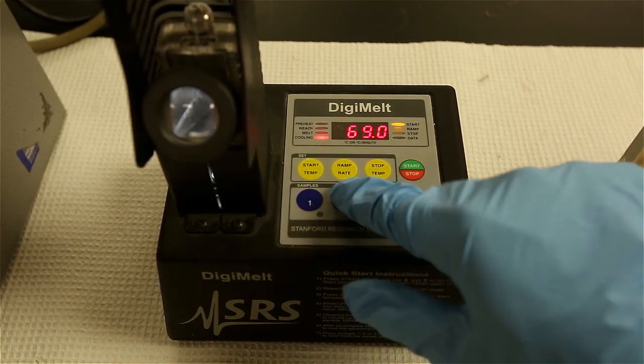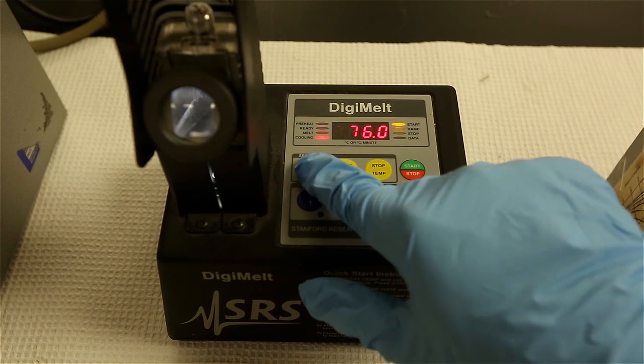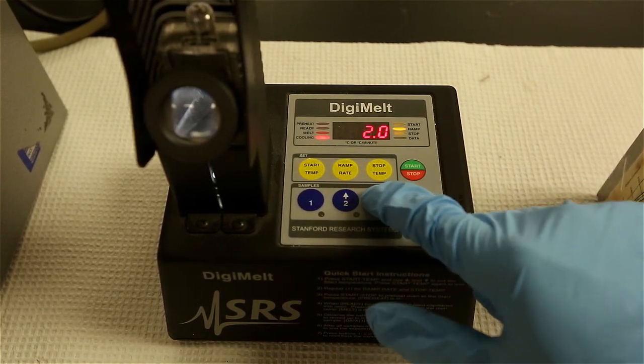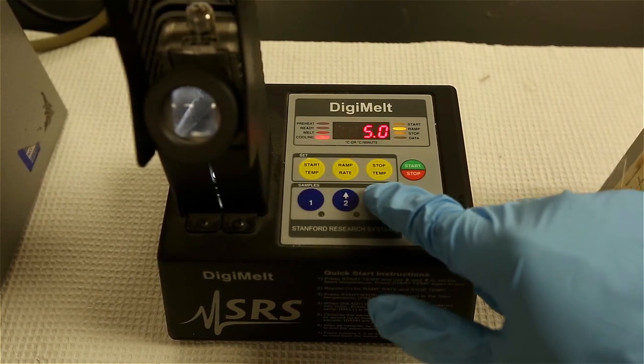When setting up the instrument for melting point analysis, you should use the temperature ramp at the lowest setting possible because you do not want to heat up the sample too quickly, otherwise you'll get an inaccurate reading.